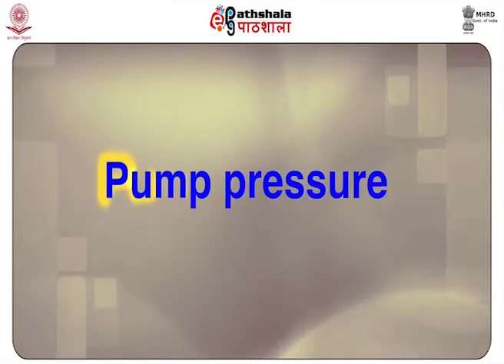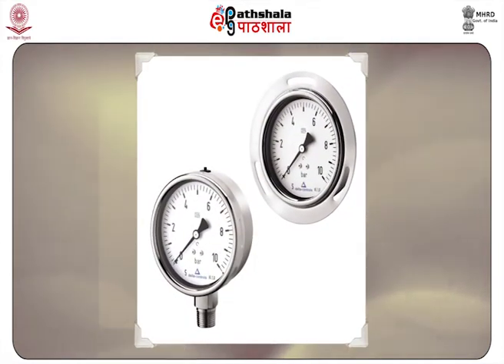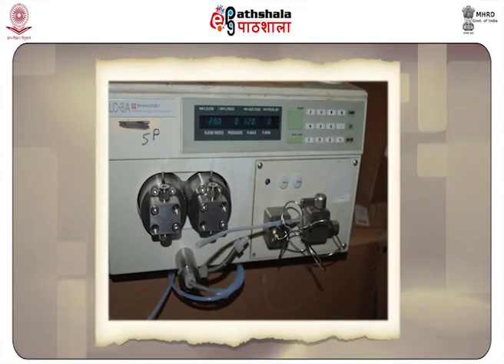Next, moving on to pump pressure. The performance of pumps is measured based on their ability to yield a reproducible and consistent flow rate. It may achieve a pressure as high as about 400 atmospheres. Various improvements have been made to modern HPLC systems to make them work at even higher pressures and consequently much smaller particle sizes, less than 2 micrometers. These are called ultra HPLC systems.